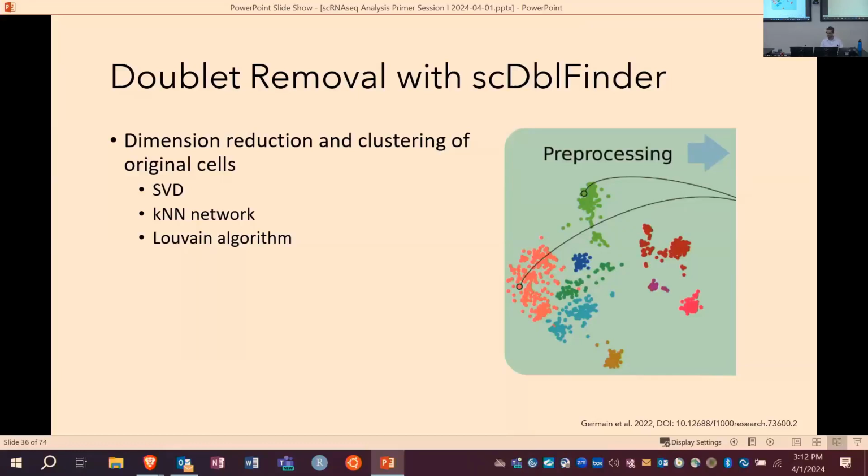And then the Louvain algorithm tries to cluster by minimizing this thing called the modularity index. Suffice it to say that Louvain is clustering cells by gene expression. As output, you get this figure on the right where individual dots are cells and they are clustered in this reduced dimension gene expression space. The colors represent what the Louvain algorithm considers to be distinct clusters.